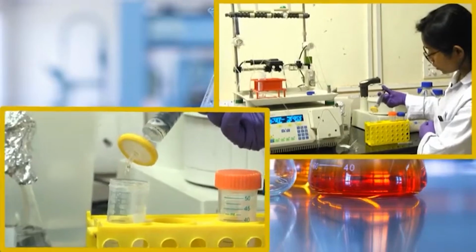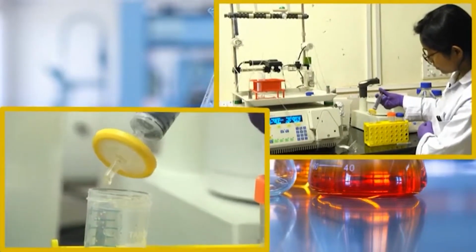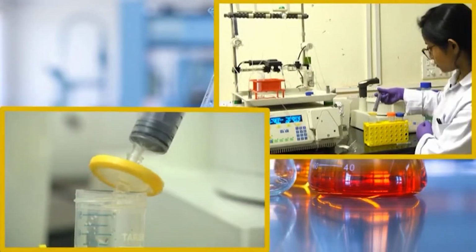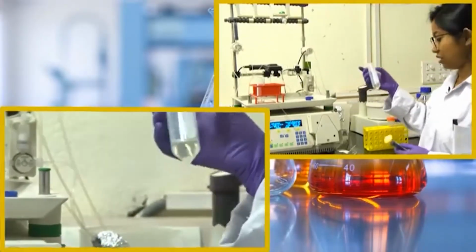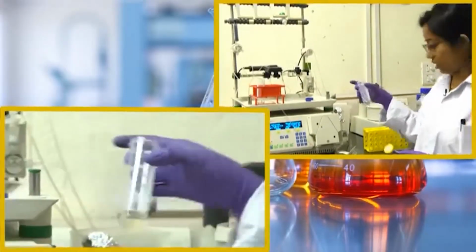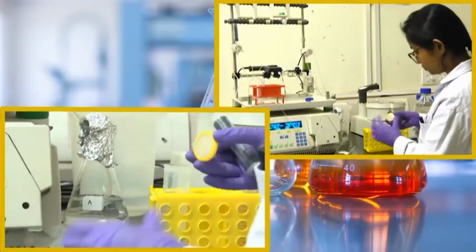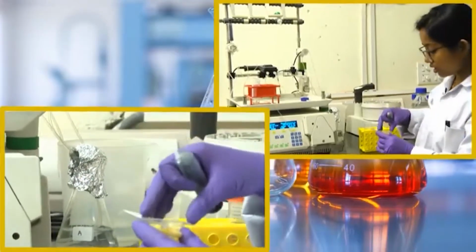Do not load any crude sample right away to the column. Now, this is our filtered solution, and we will pass this solution to the column. You can use this kind of filter just once, so discard it after using it.